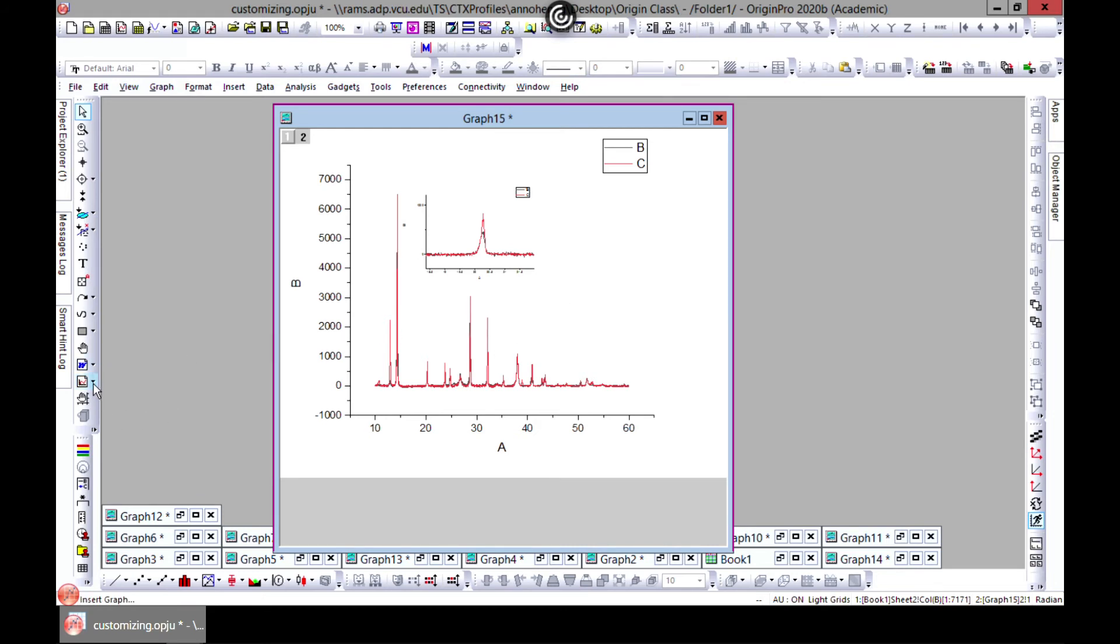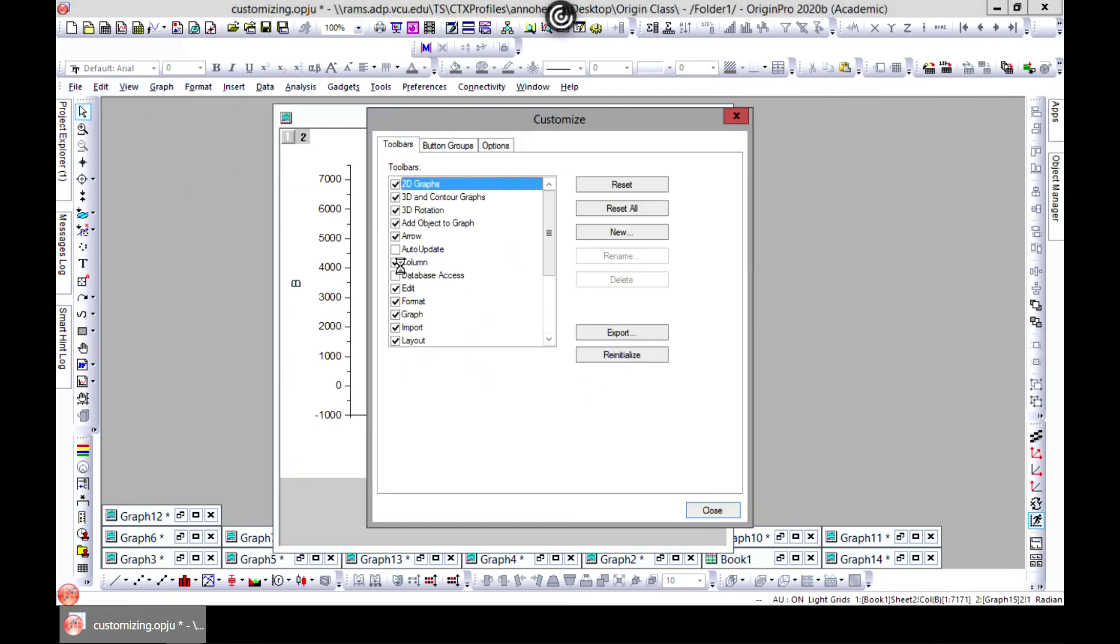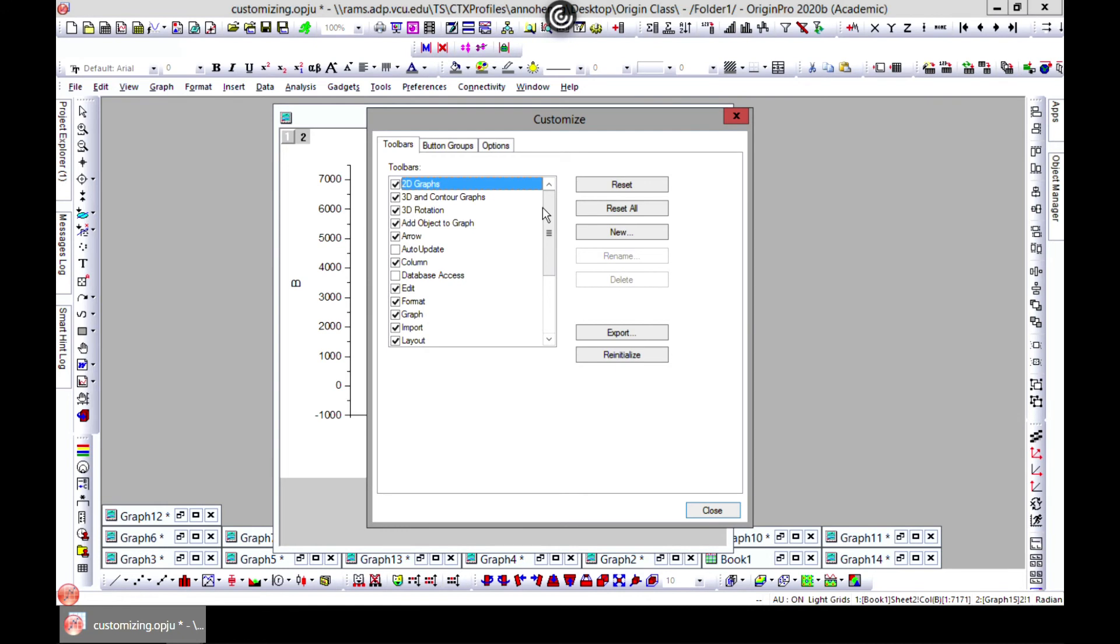What you do is you come to the Add Object toolbar. If you don't have it, remember you can go to View, Toolbars, and you can look for it—Add Object to Graph toolbar. So you can get that here.